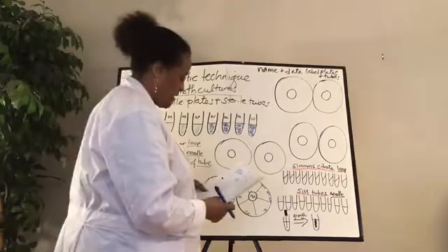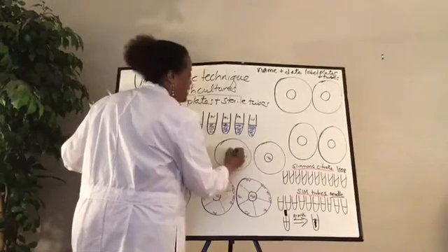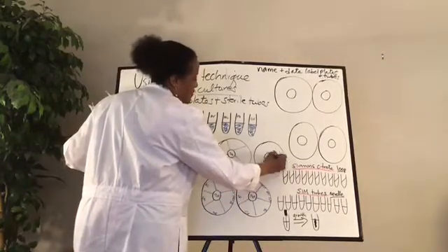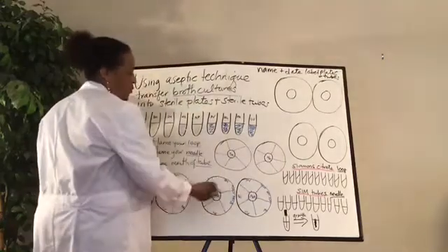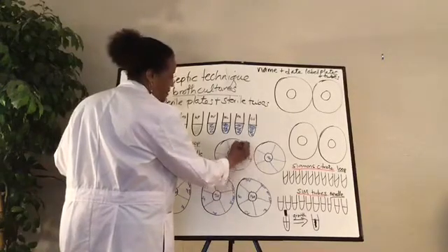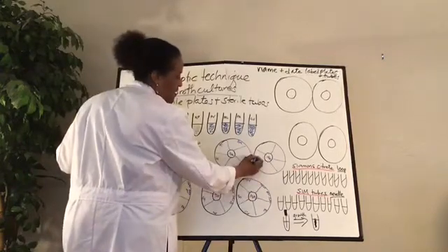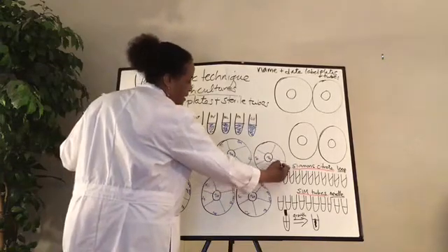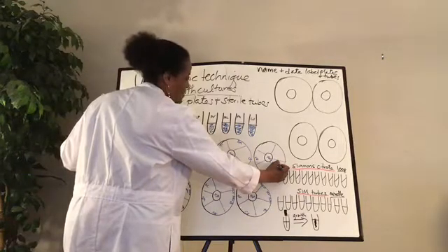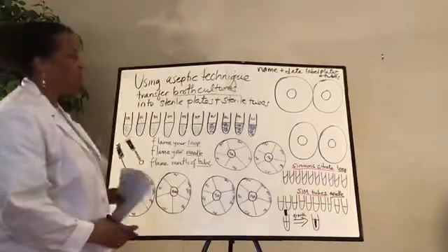I'm just going to do all of them. Let's do the MAC plate next. Let's get these 10 bacteria on here. All right, so we know the order. SA here, MS here, SM, BM, EC. This one is KP, CV, let's see, what's this, PA, ML, and PV. All right, we got the MAC plate all labeled up.